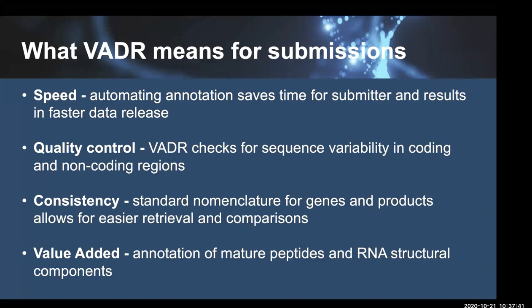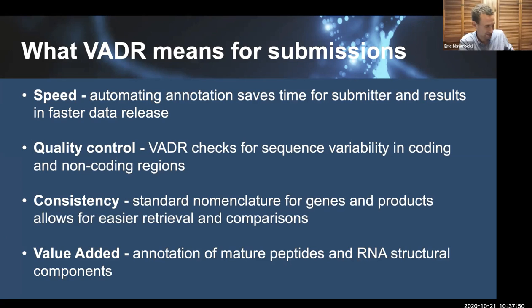Hi, this is Danny. Sorry, I missed the part at the beginning where you probably talked about what the output was. Was it like Sequin or ASN format? I did not talk about that actually, so you didn't miss it. So the output is a Sequin table file. It's not ASN. Oh, so it's something you feed into tbl2asn? Correct. If you're doing it by yourself, yes, that's an additional step that needs to be done. If you're submitting it through GenBank, they automatically do that.